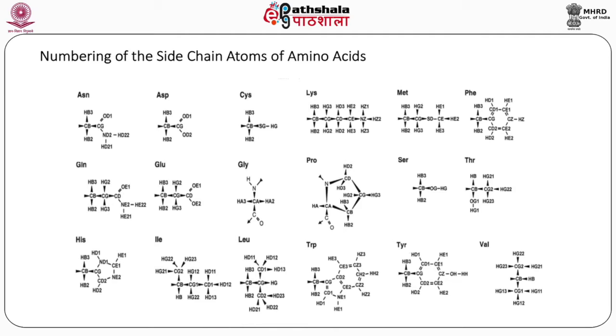Let us look at a longer residue, isoleucine. In isoleucine, we have isomerization with respect to leucine. We see Cb, which has 1 Hb, then we see a methyl group linked to C beta as Cg2 and the hydrogens connected to it as Hg22, Hg21 and Hg23.